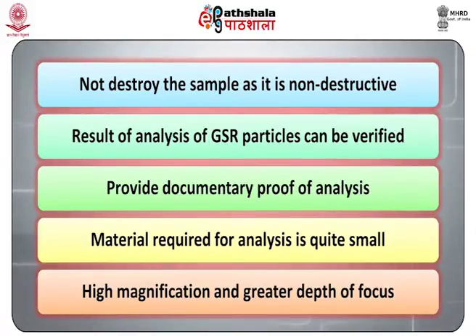Number 3, it can provide documentary proof of analysis. Number 4, the material required for analysis is quite small. Number 5, and the last one, SEM has a very high magnification, better resolving power, and greater depth of focus.